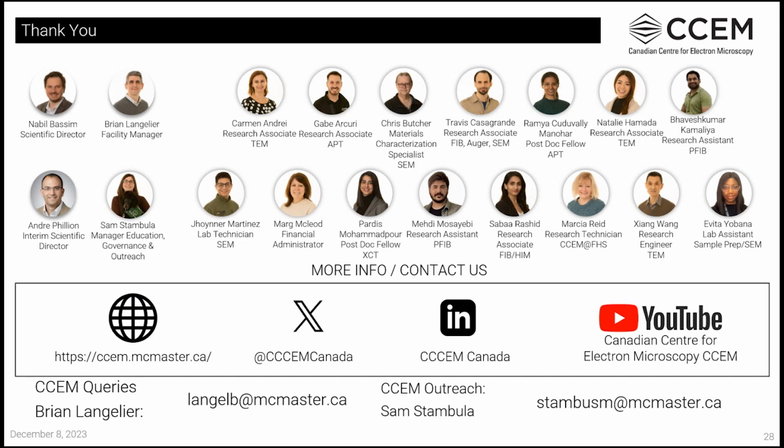Great, thanks Natalie for the awesome presentation. It made me really jealous that I don't get to use the Spectra. Oh, you can, no problem. It's pretty easy, all automated. Yeah, I know, that's what I was jealous of. I remember sitting on the Titan doing the alignment, so the automation is great.